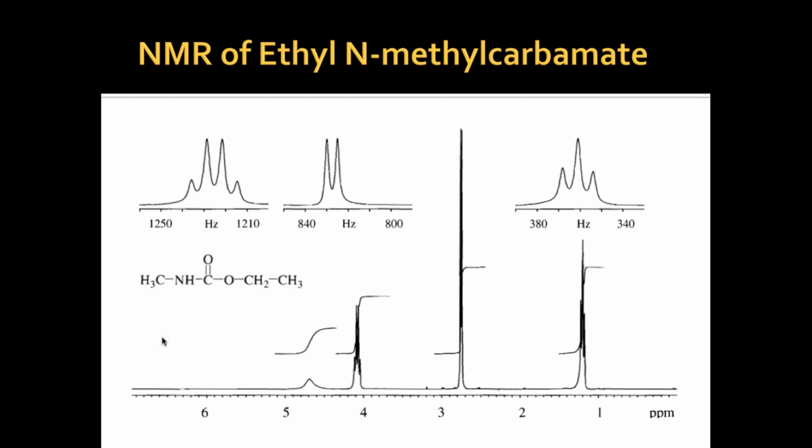Once you see the spectrum, we should be able to grasp which peaks show what. You have a triplet, you have a doublet, you have a quartet. You have one broad small peak. You have three sets of protons, CH3, CH2, CH3, so three big peaks. You have the NH proton. Now what is what?